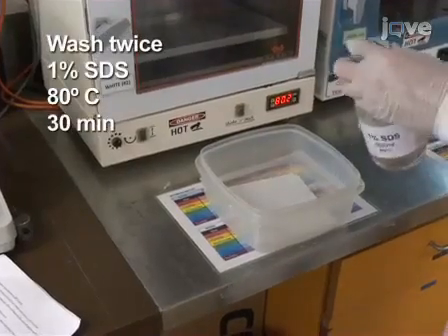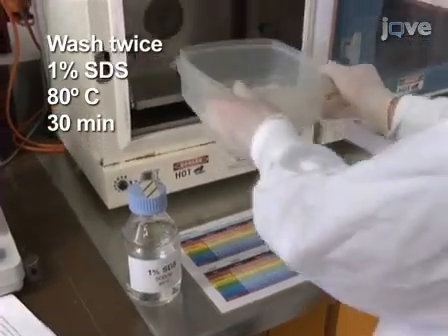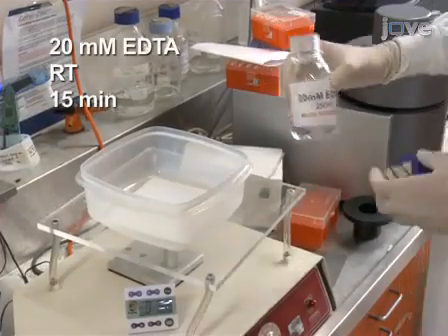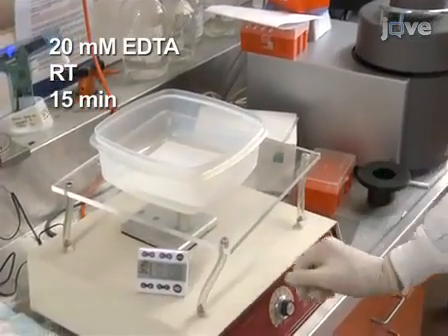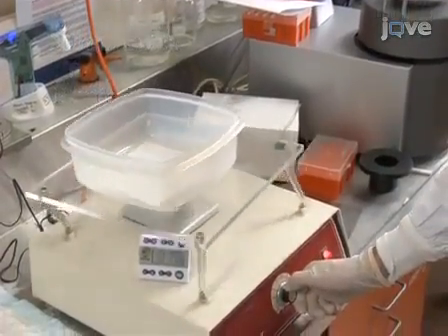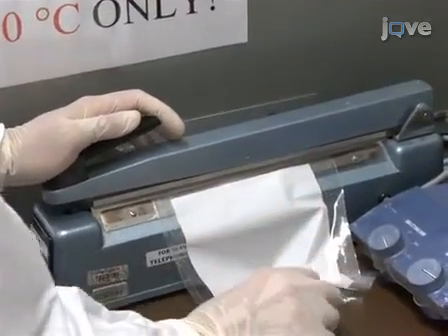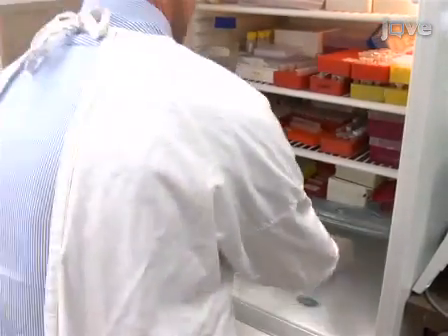To regenerate the membrane, wash it in 250 millilitres of 1% SDS at 80 degrees Celsius for 30 minutes twice. Then wash it in 240 millilitres of 20 millimolar EDTA at room temperature for 15 minutes. Seal the membrane in a plastic bag with 10 millilitres of 20 millimolar EDTA and refrigerate at 4 degrees Celsius for future reuse.